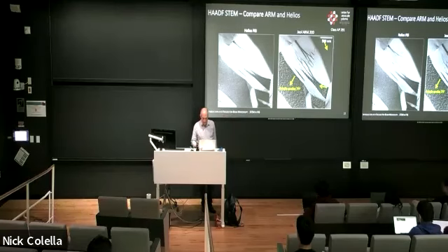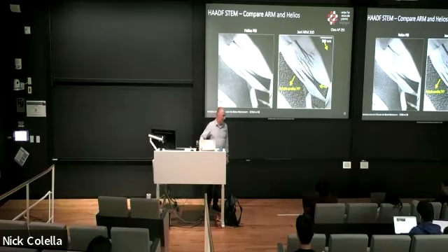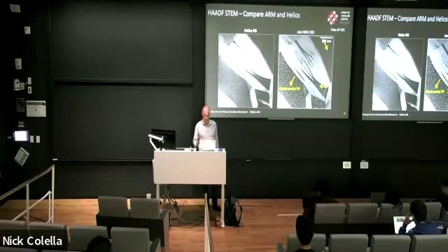And it actually turns out that what you see there has nothing to do with the sample itself, but what you see there is actually the effect from the gallium that has been implanted into the surface layer of the TEM sample.